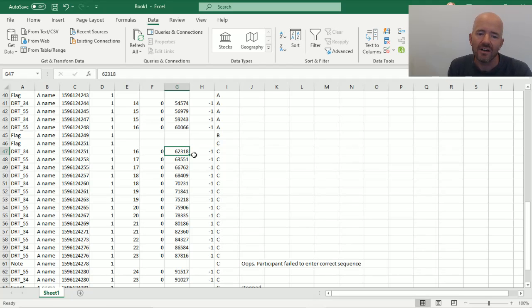Because a DRT probe could occur over 3 to 5 seconds following the standard ISO procedure, there's a lot of potential time in which the flag can change. So just keep that in mind as you're analyzing the data.